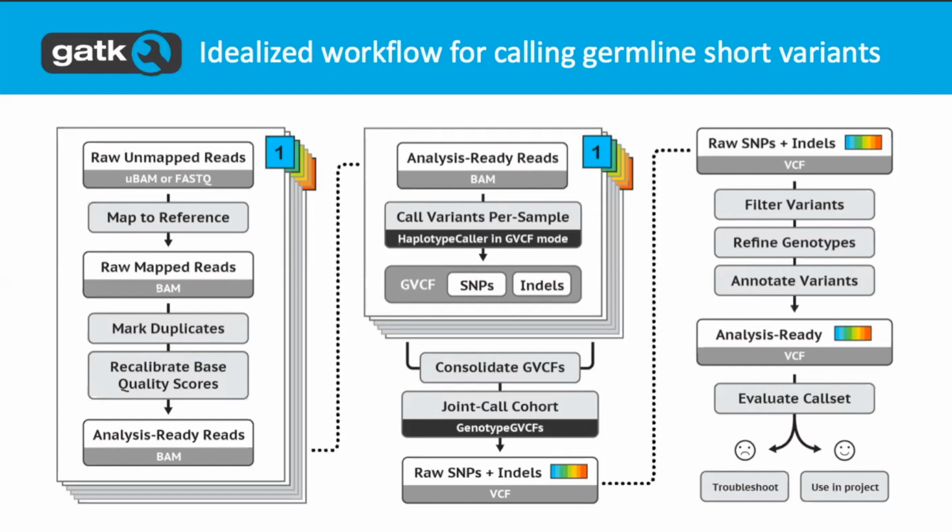Now we have a workflow geared specifically for single genome analysis, where the filtering part uses neural networks, specifically convolutional neural networks. We'll have a presentation that touches on that tomorrow. It performs much better if you have only a single sample's worth. So for now, for multi-sample, we use the classic VQSR. For single sample, we use CNN.